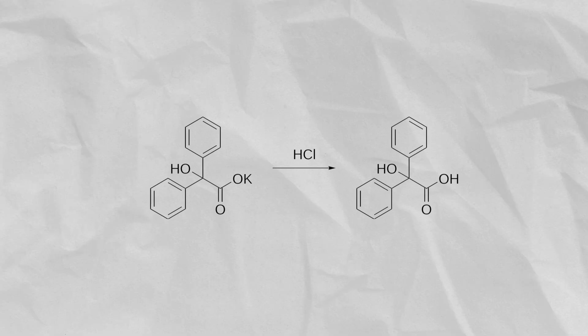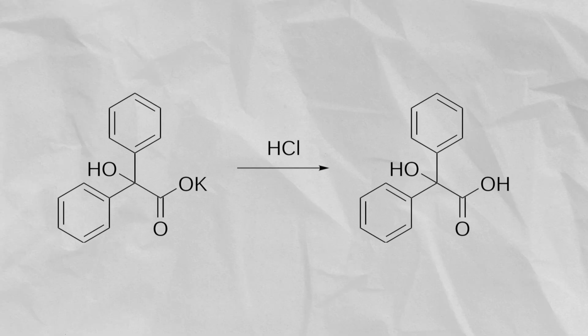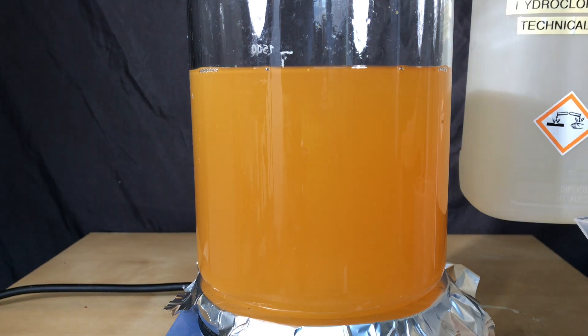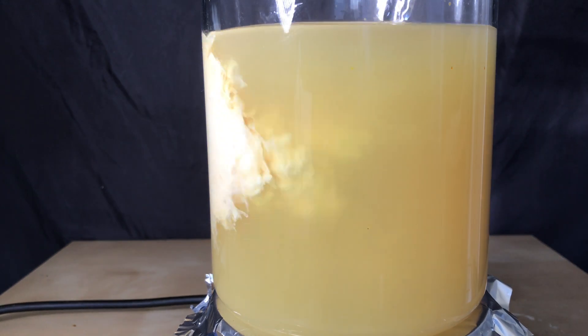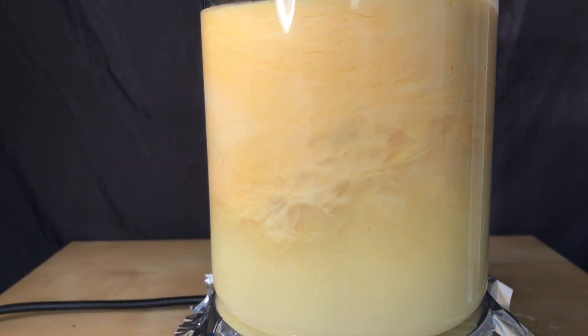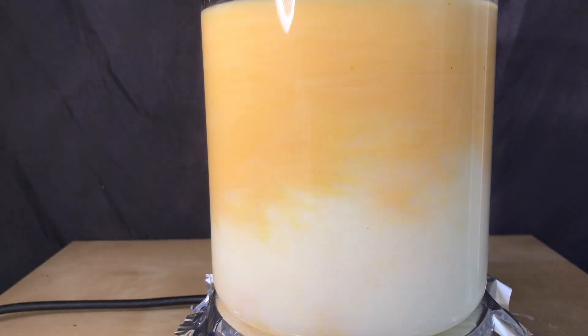Next we need to turn the benzilic acid salts into benzilic acid. We're going to do this by using hydrochloric acid. I used about 500 milliliters of 37% hydrochloric acid, which is a huge excess. Benzilic acid has a solubility of about 2 grams per liter so we're not going to lose a lot.